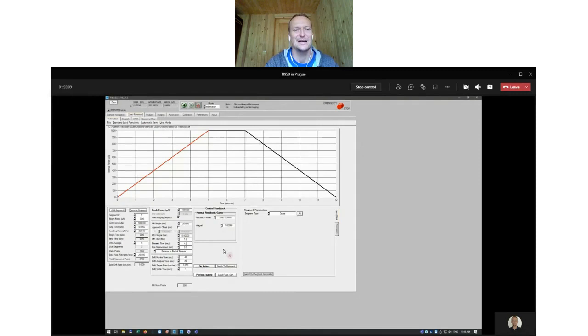So we always cared about the indentation curve. How does it look like? And actually about a single indentation curve, right? So you can derive information from the single indentation curve about your sample. I would say 2-3 years ago, we introduced high-speed mapping, so we can synchronize the piezo motion with our transducer. So while the scanner is moving along the sample surface, the force displacement sensor can make the indentation. So we can do it in a very fast manner.